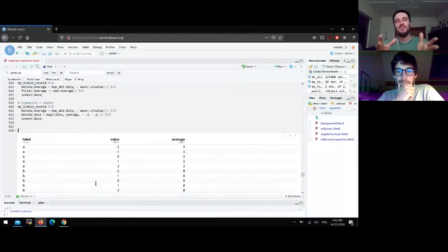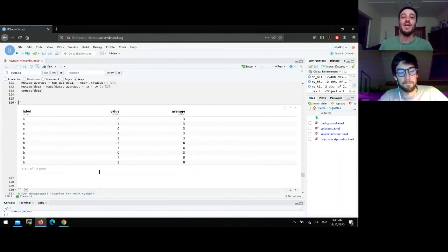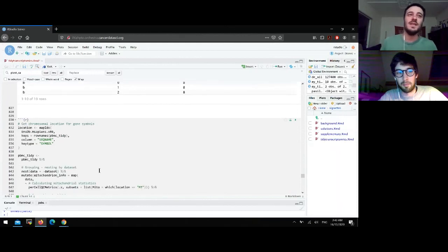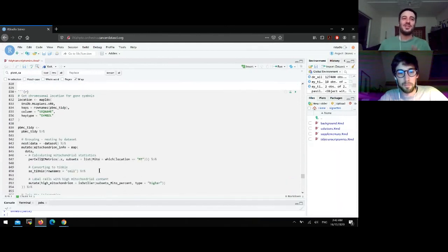So first we nest, and then we map. This is incredibly powerful. If you start to explore this, you understand how you can do a lot of things without ever leaving the data frame framework, the data frame paradigm. Okay, so why do I show you this? Because also the table abstraction we are using can be used with nest.